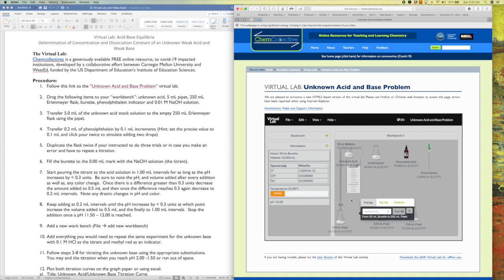And so I'm hovering, and now we're using them together. It's still showing the pH of the solution in the burette, but once I start the addition, it will switch over to the measurements of the pH in the flask. So I'm going to go by increments of 1 ml, and I am going to now pour the 1 ml. And so what we see happening, right?